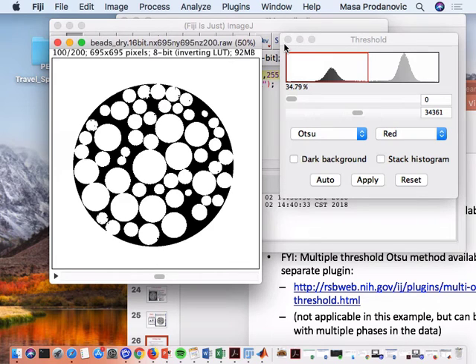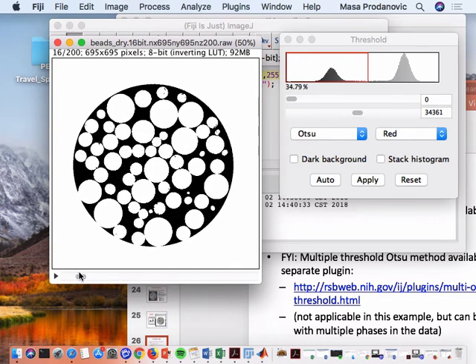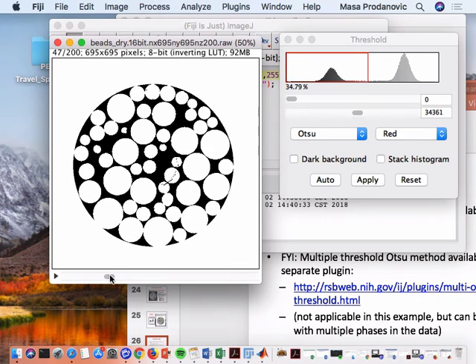You should get the numbers that are reasonable to expect. All right. So basic calculation would be to calculate porosity, and that requires counting. Now, in this case, I have to live with errors that I have. Well, they might be real. So, for instance, I can see that these beads have speckles. And actually, when I look at the original image, it looks like I have little holes in there. So whatever I was shopping for was not the most precise bead ever. And that's actually common. Natural rocks will be even more imperfect. So nothing to write home about. But you do have to work with that.